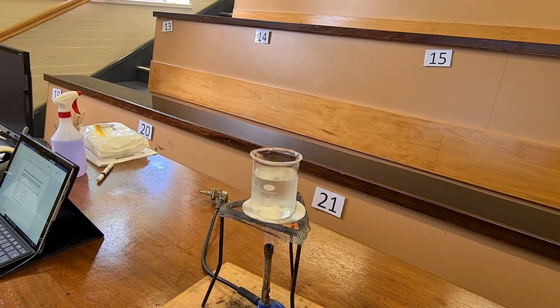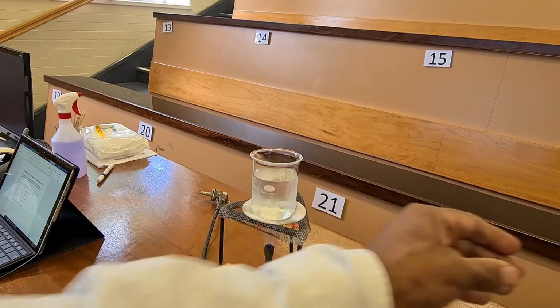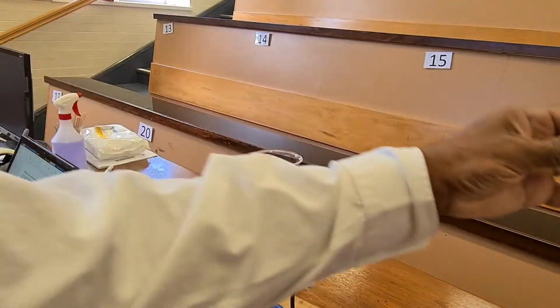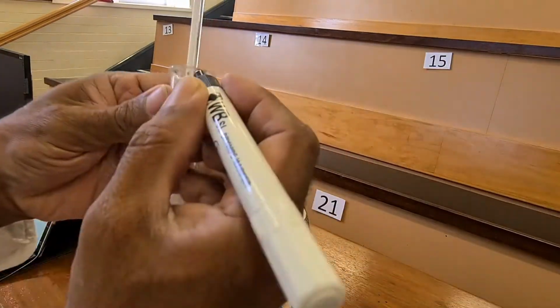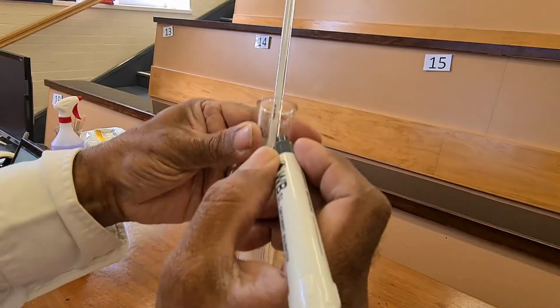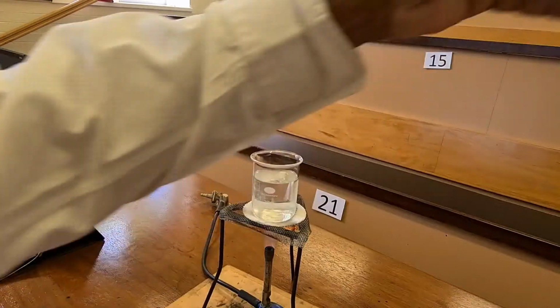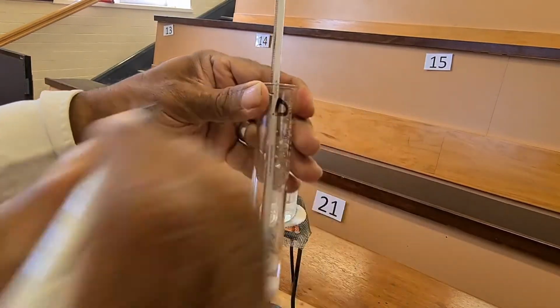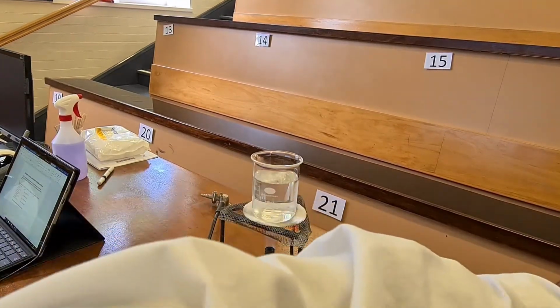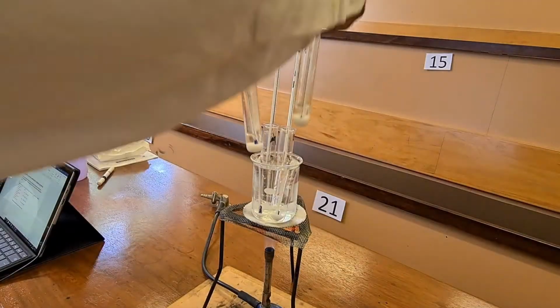So one thing I can do is to label them A, B, C, and D. And that will give me the 4 test tubes in order when I put them into that warm water. So here we go, going into warm water.